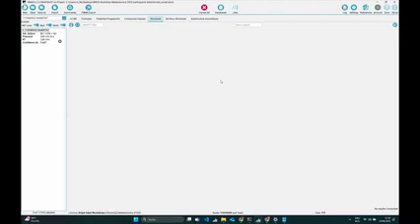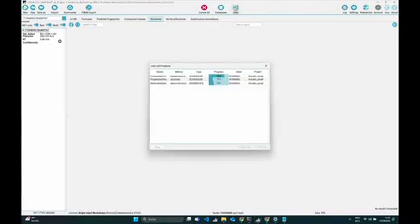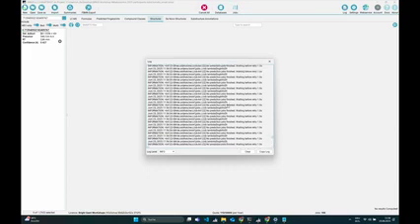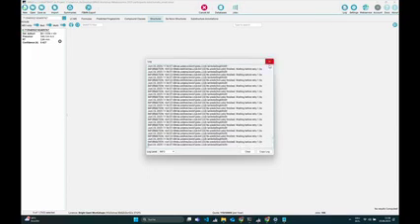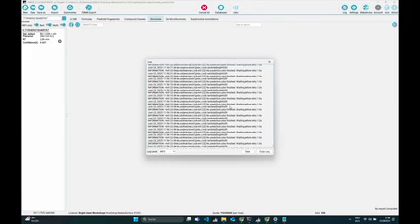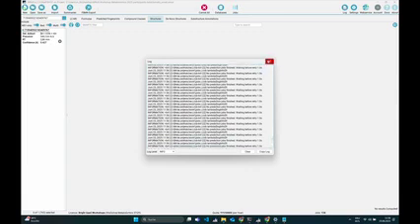And what I can show you here now, what I didn't show you before, is you have this jobs button where you can see whatever computations you perform, how the progress is, how far it is in the computation. While this is computing, what I can also show you is this log, which can be quite important. So especially if you get some errors, you might want to open this log panel and see if you can find some error message that will tell you something, maybe whatever you imported didn't work, maybe you just imported a file which doesn't have any content, or whatever went wrong, it probably is in this logs panel.